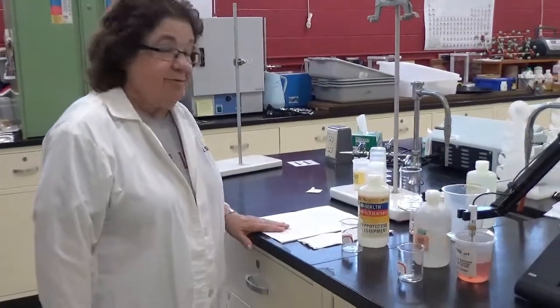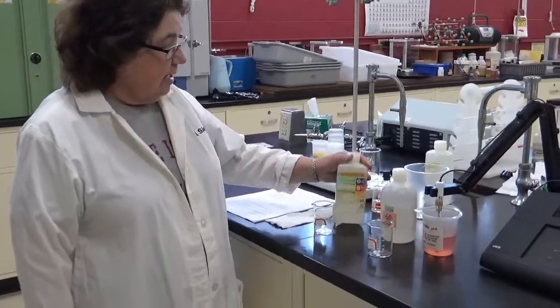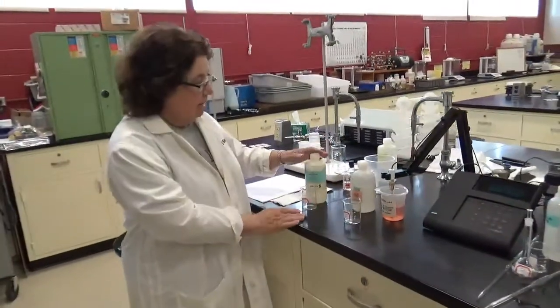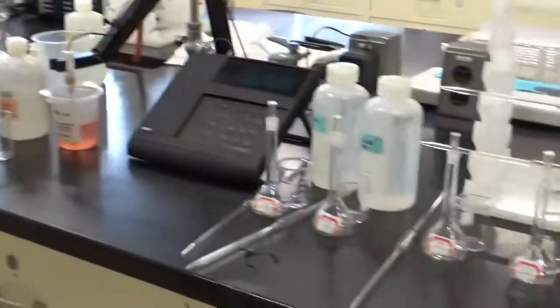According to the directions, and you can look at those as well, we're going to take hydrochloric acid, which is a strong acid, and it's 0.1 molar. And I'm going to put a little bit in a beaker. And then I'm going to take this and do a series of dilutions.